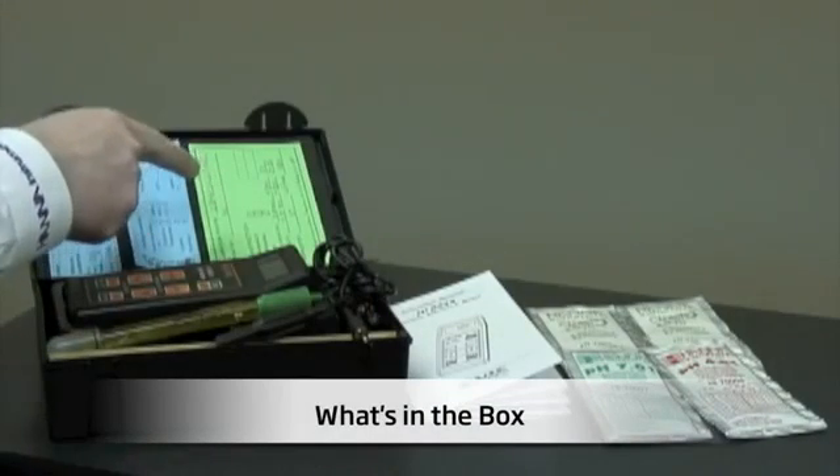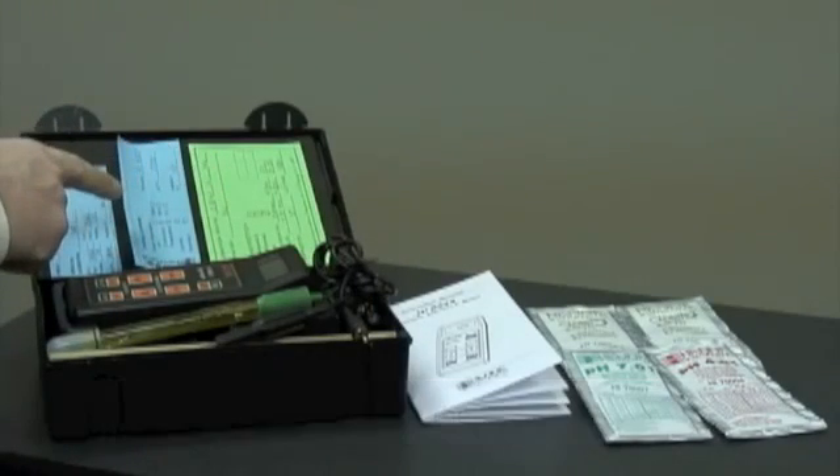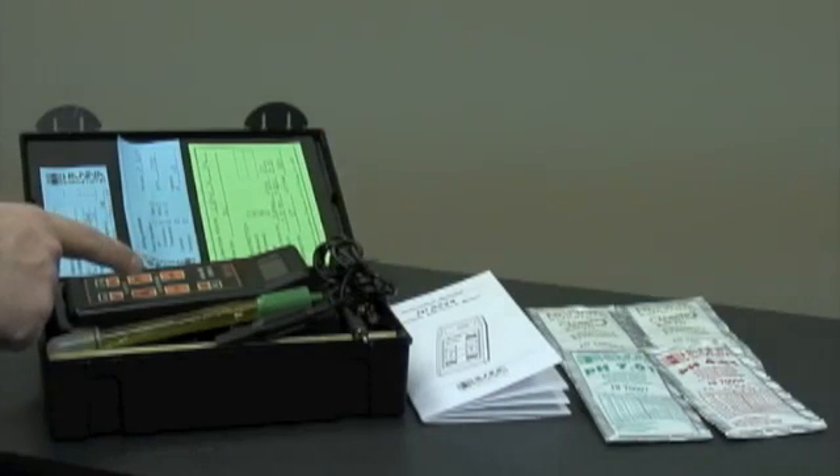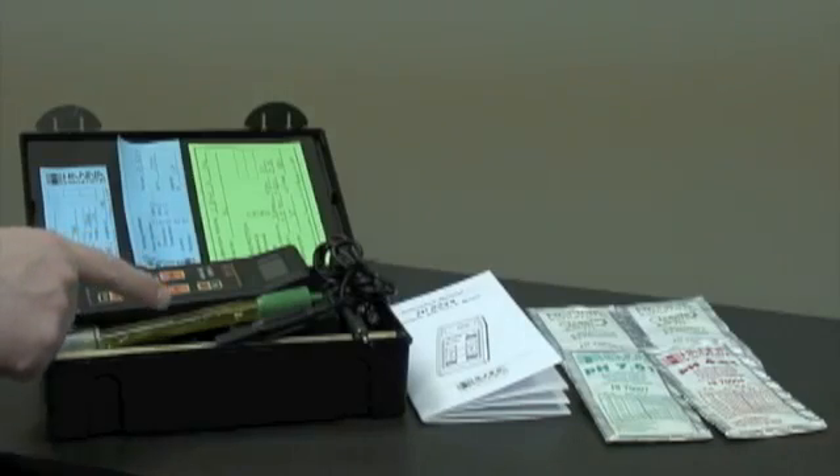Now I'd like to show you what comes in the box when you receive your unit. You'll receive a calibration certificate for the meter, a testing certificate for the pH probe, a testing certificate for the temperature probe, the HI8424 pH meter, and a pH probe.